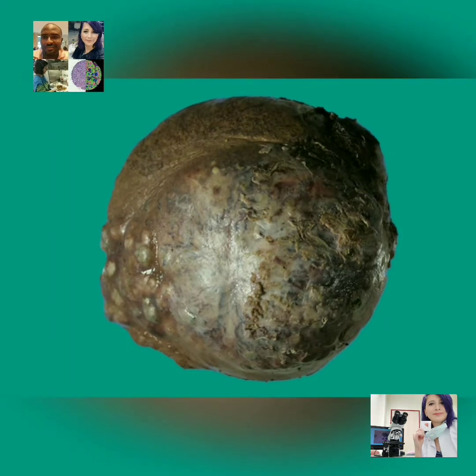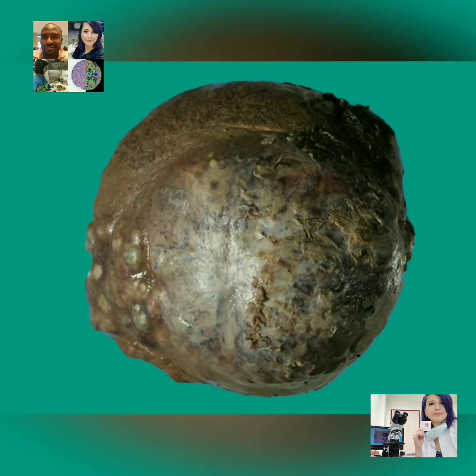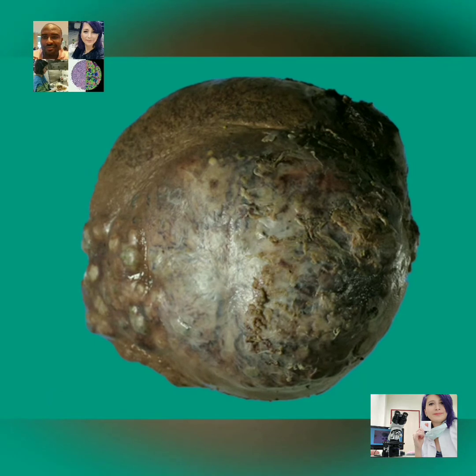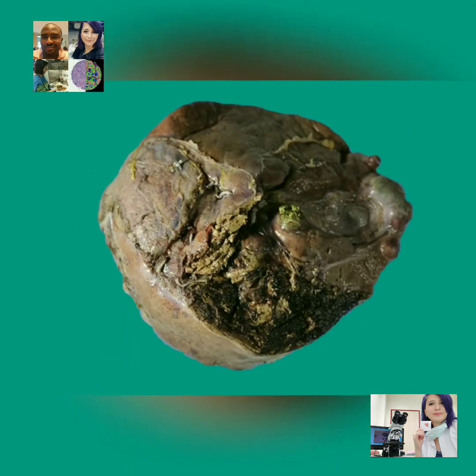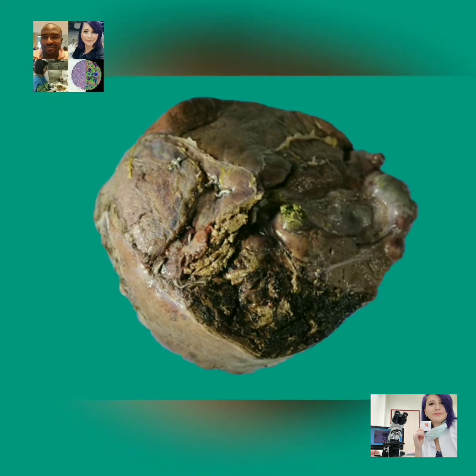Good day, everyone. Today we'll be talking about handling liver biopsies in routine surgical pathology practice. The liver is the second largest organ in the body and is important in most of our daily body processes. As a result, it can be afflicted with different diseases. Some may be medical, while others may be surgical, requiring excision. An adequate histologic diagnosis is required to be able to treat or manage the various diseases of the liver.